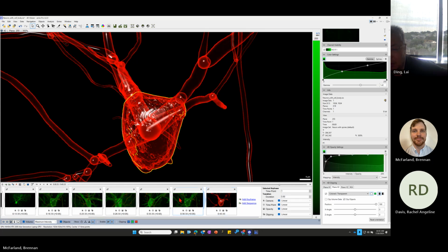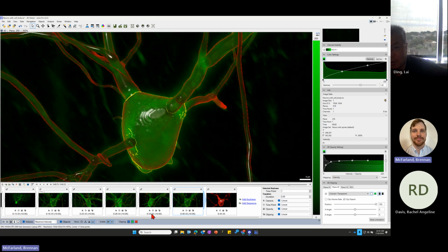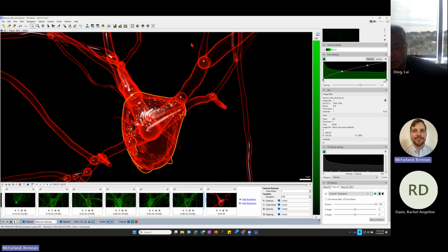It will also recognize the changes that we can make in the background intensity. So this could also be another way. Instead of clipping, you can do a slow fade from the background, like the histogram that's loading this data, of your volume. So either one works.